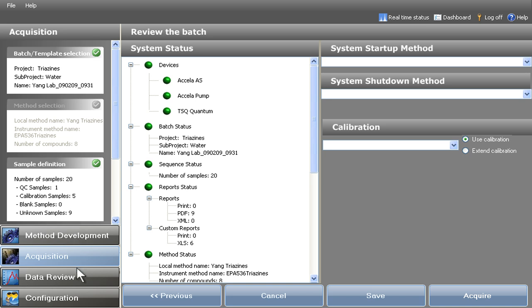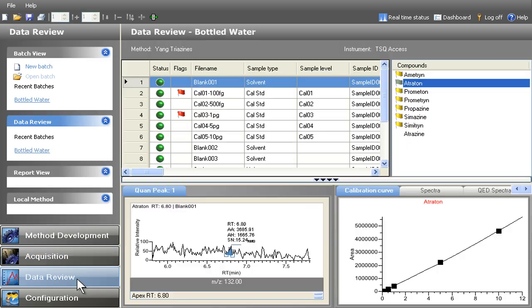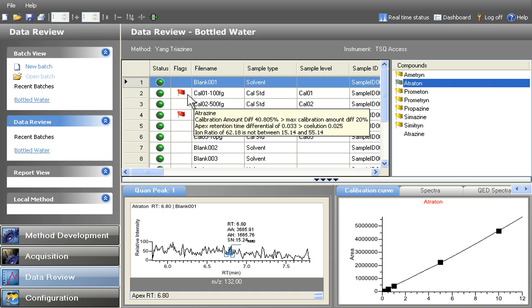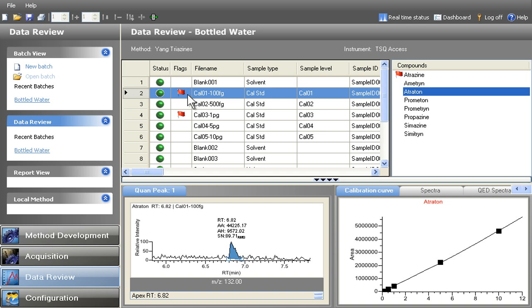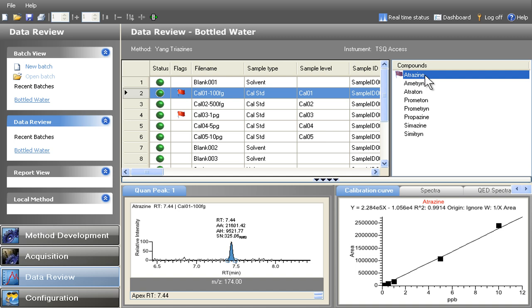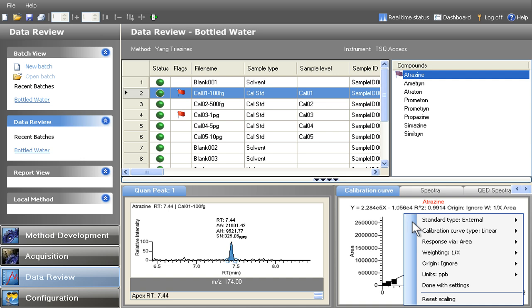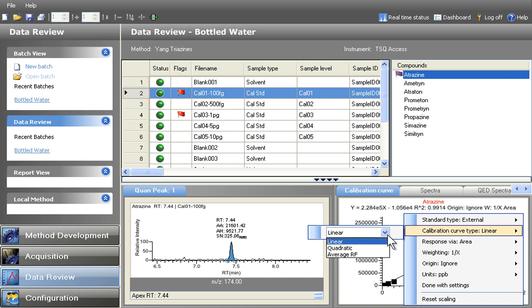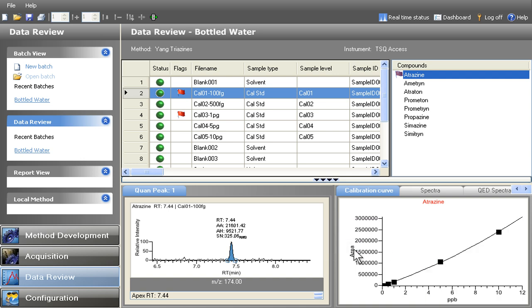TraceFinder's powerful data review capabilities allow analysts to quickly inspect flagged samples with just a few clicks. The at-a-glance view enables analysts to evaluate and adjust peak integrations, calibration curves, and ion ratio values. Users can also compare their results with the built-in spectral library to confirm analyte identification.